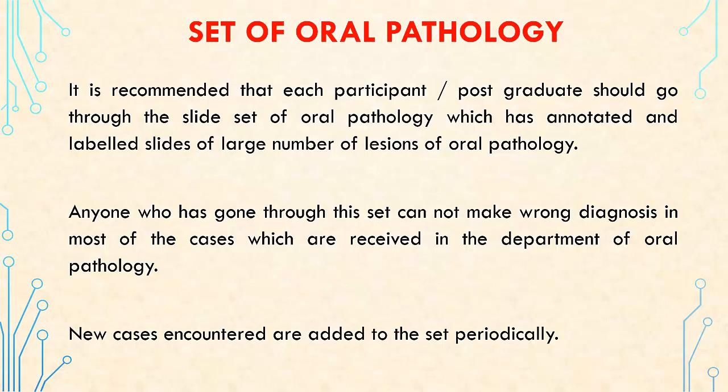Here is an example: an epithelial cell with pink cytoplasm, vesicular nuclei, and indistinct nucleoli.